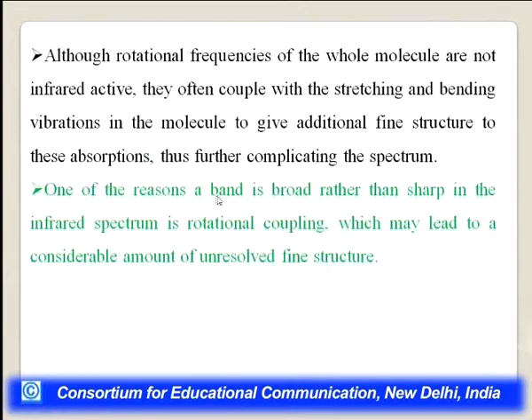One of the reasons a band is broad rather than sharp in the IR spectrum is rotational coupling, which may lead to a considerable amount of unresolved fine structure. Unresolved means you cannot analyze it completely.